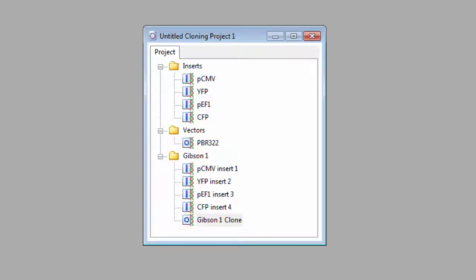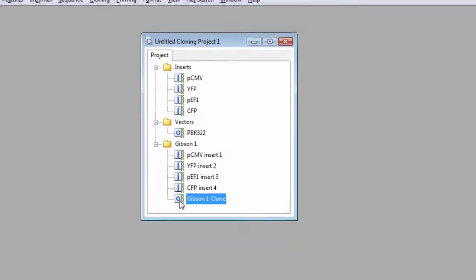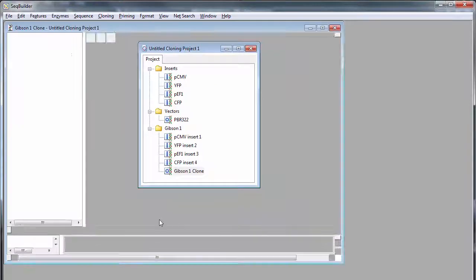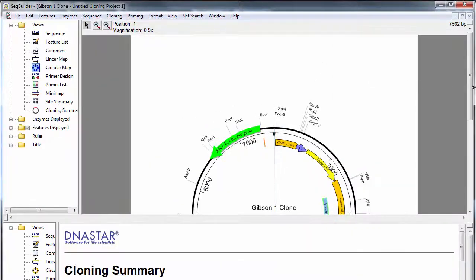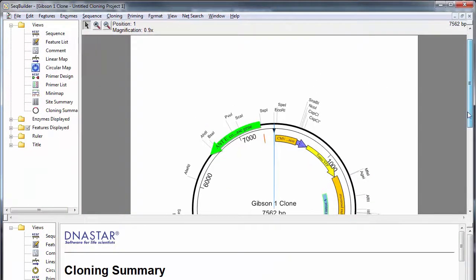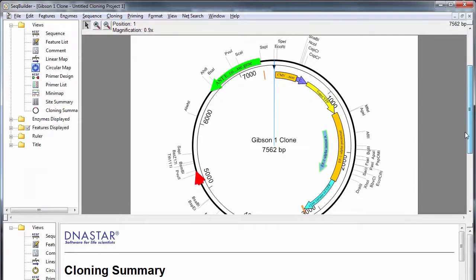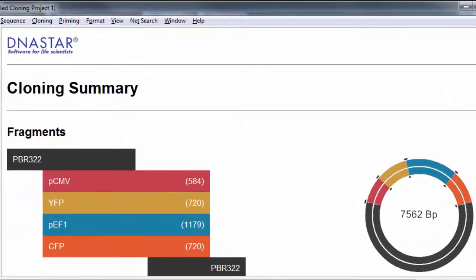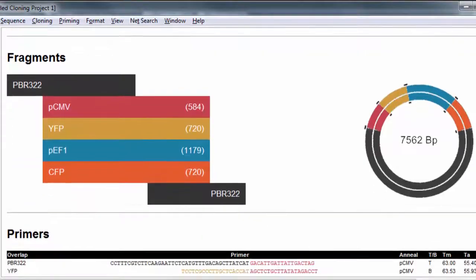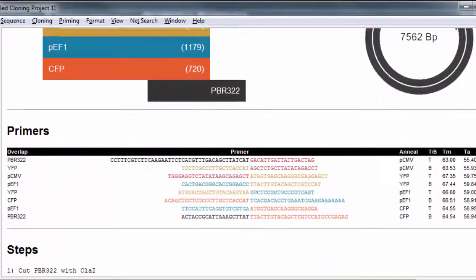Double-click on any file to open it in the document window. Click on the Cloning Summary view to view the same information that was displayed in the Summary tab during cloning.